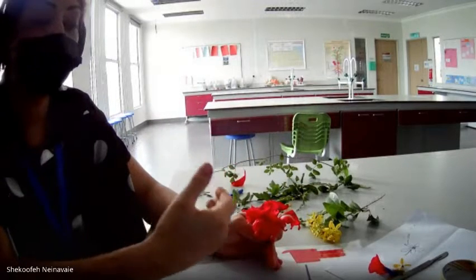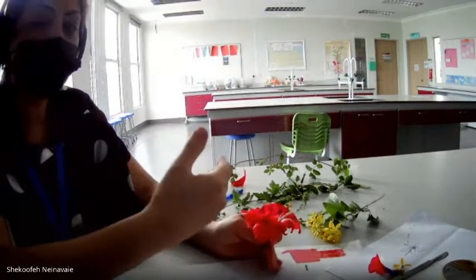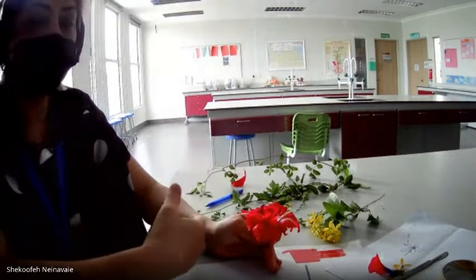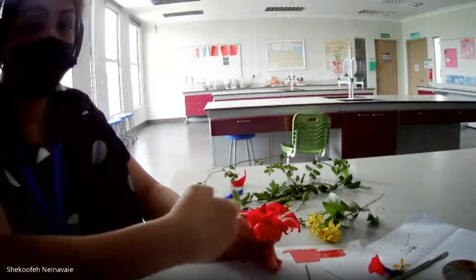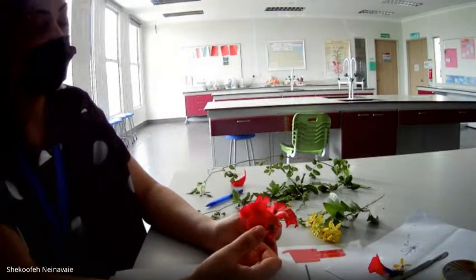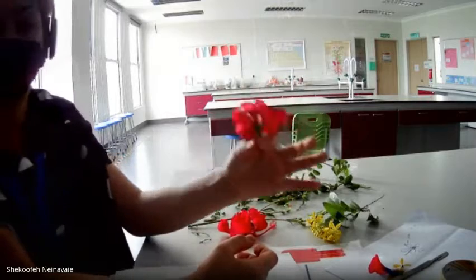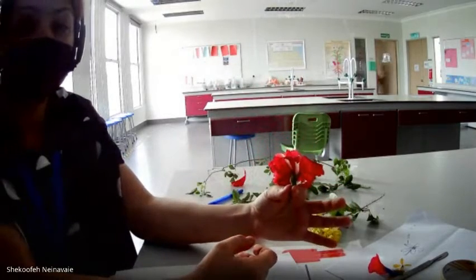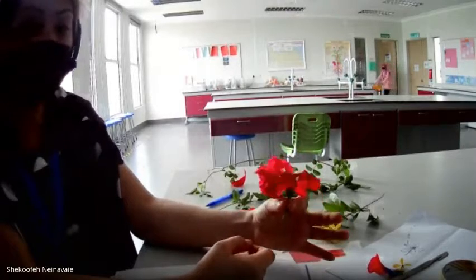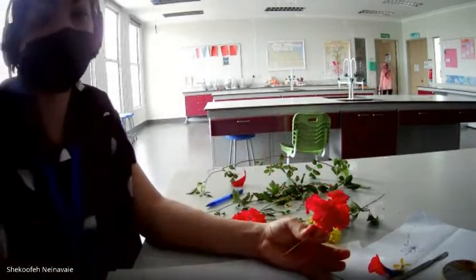Once you start the dissection, you begin exposing the internal organs, so you can draw them too as an individual sketch. But for the time being, what I see, I just draw. I do not need to shade, you don't need to color, you just define the boundaries and those important parts.